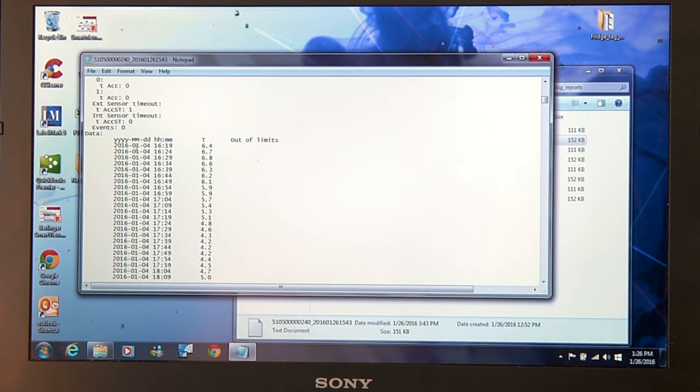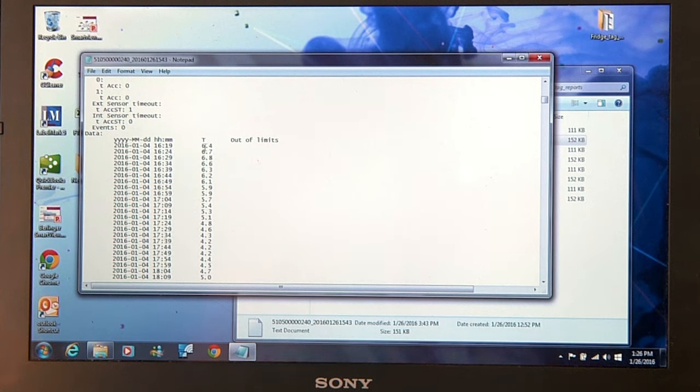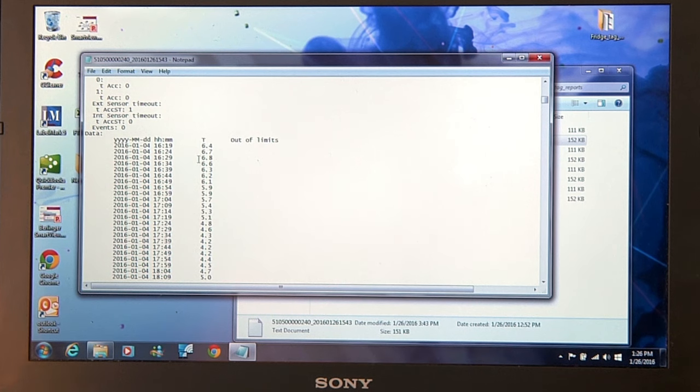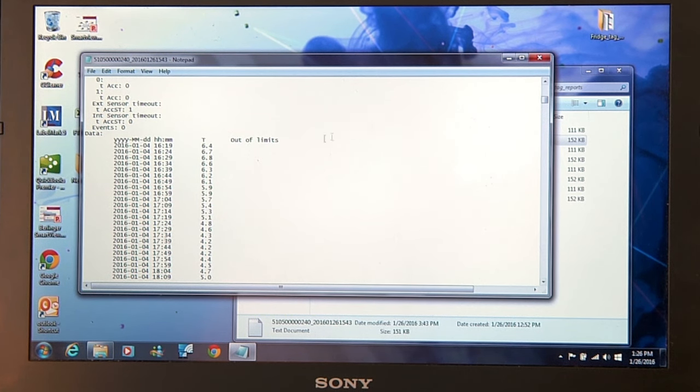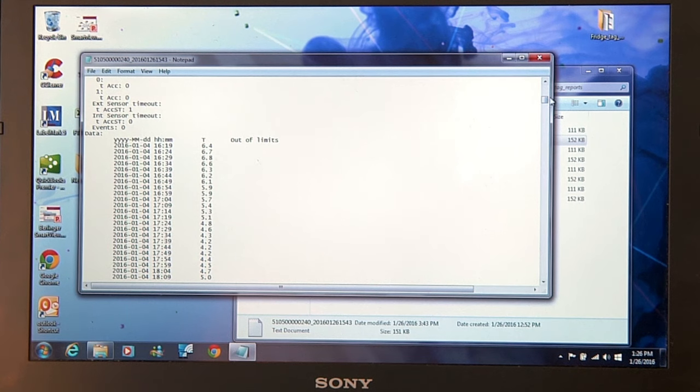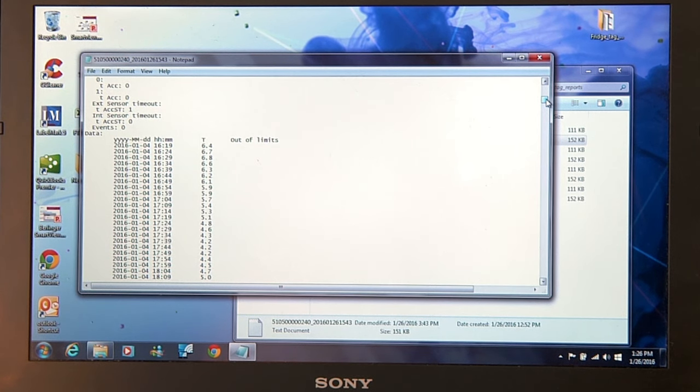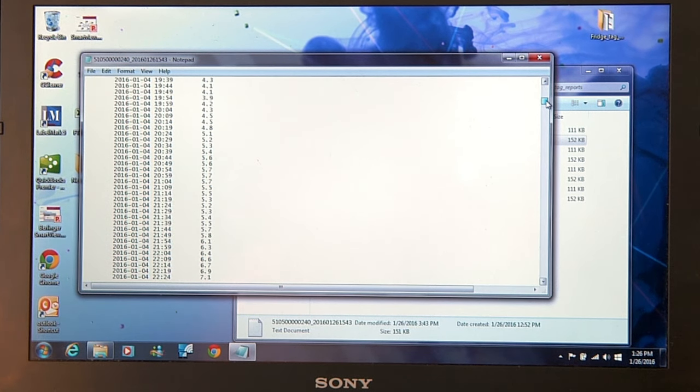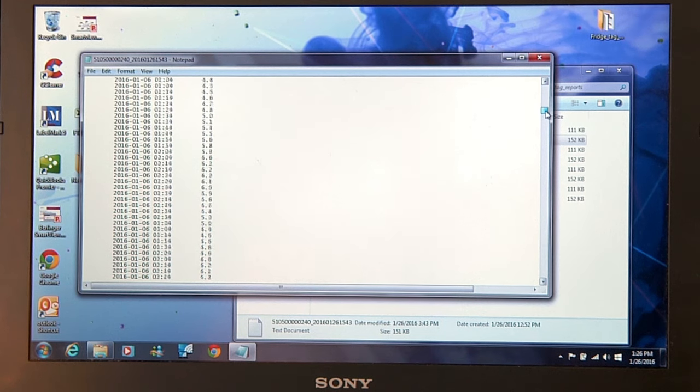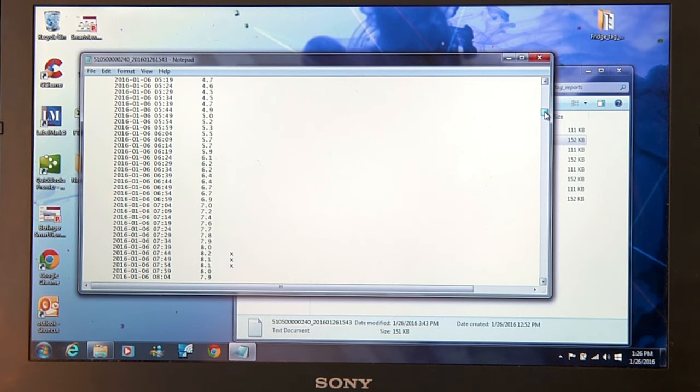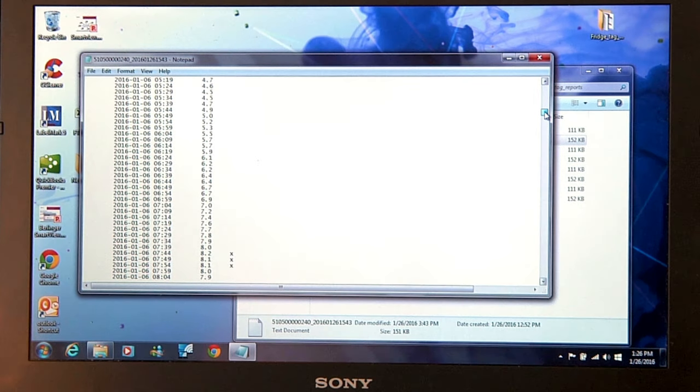We see year, month, day, and time of the reading. It stores every five minutes for 56 days, and you can see each temperature reading. There's also an out-of-limits column, which if you're looking for some alarm data, you go to the right and scroll down. And when you see an X, as you see here, that indicates an alarm.